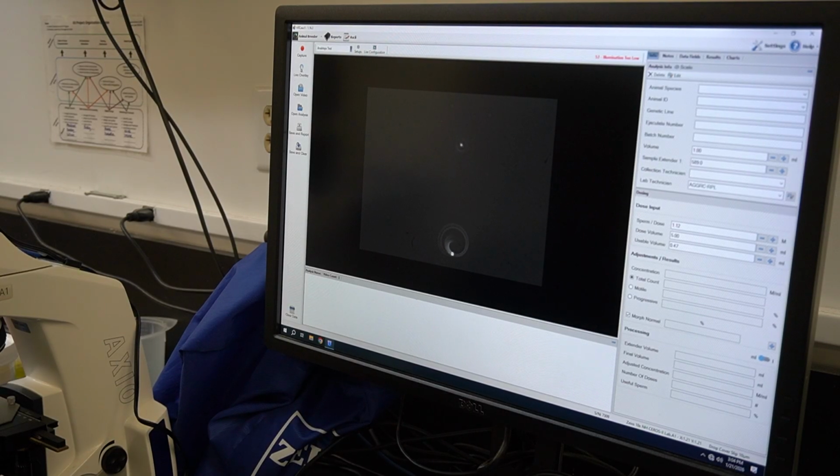Like this one, compared to those other 2, I would say is our slower moving one. Stationary, and so on. And then we'll stop doing this once we get to 100 total.